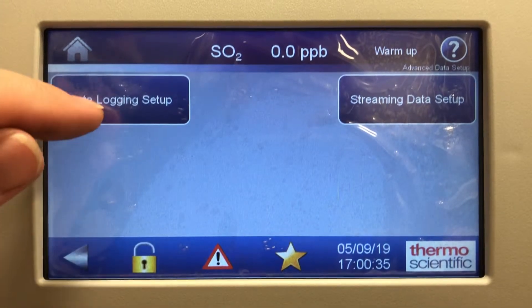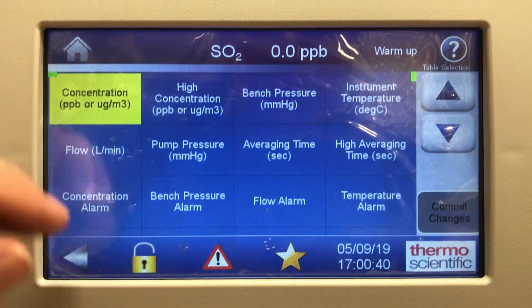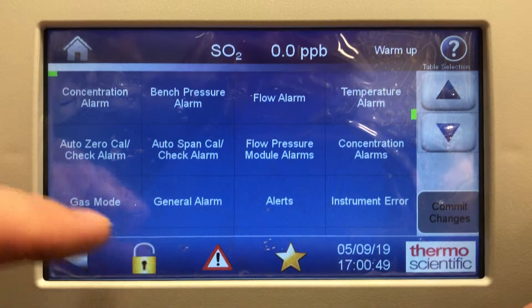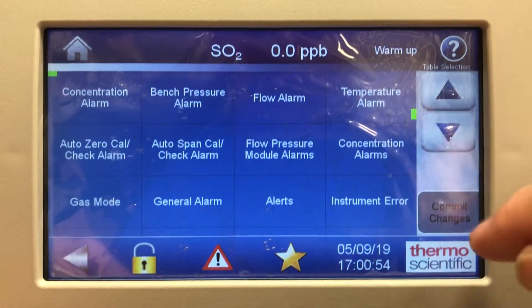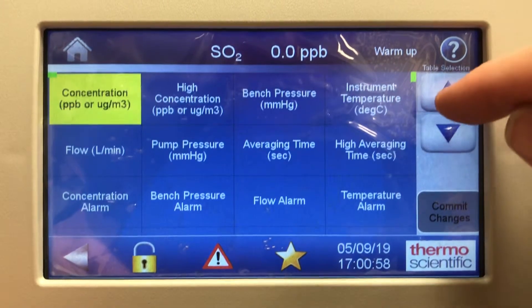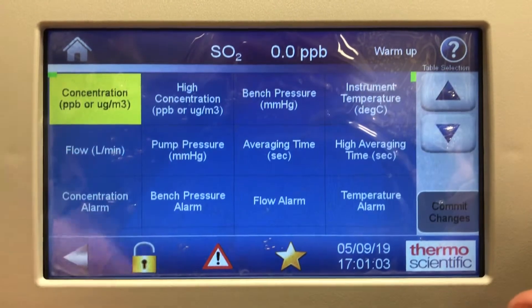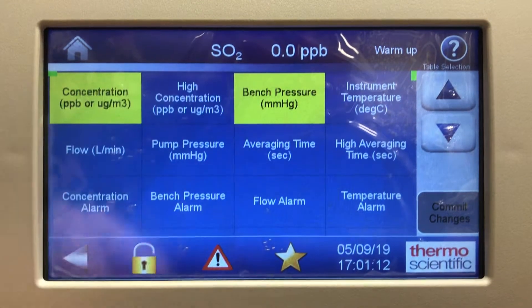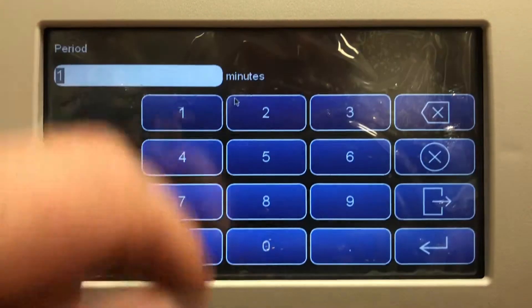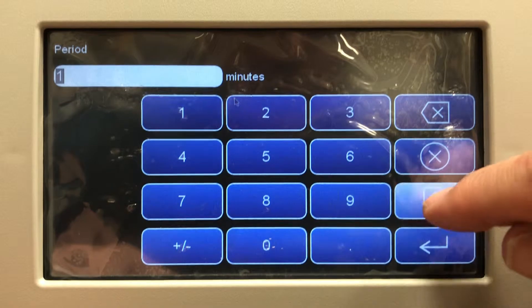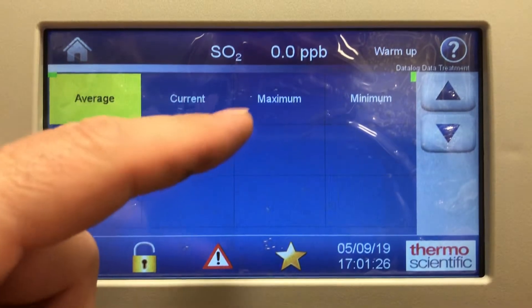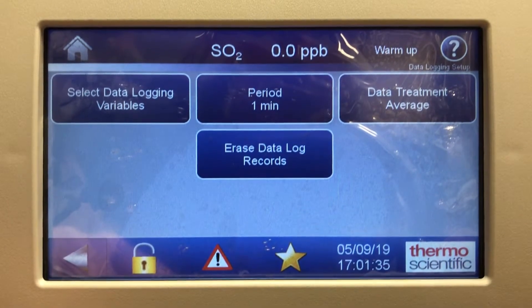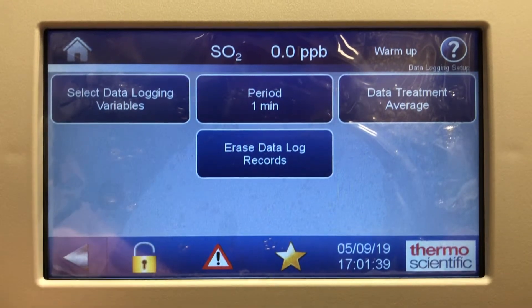In advanced data setup, there's a data logging setup where you select data logging variables. There are lots of choices: flow, pump pressure, averaging time, flow pressure, module alarms, alerts, general alarm, gas mode, and more. Once you select it, hit commit changes to activate it. For example, if I wanted to look at bench pressure, I'd highlight it, hit commit changes, and hit enter — now bench pressure is added to the data logging. One minute is a good resolution. Data treatment can be set to average, current, max, or min. You can also erase all data log records if you've accumulated too much over the years.